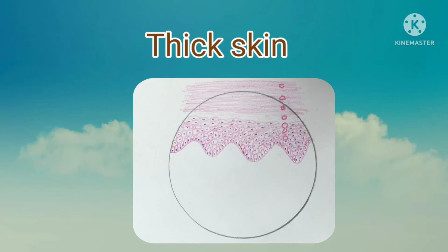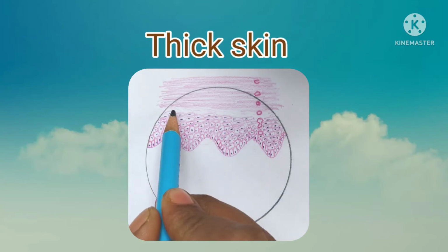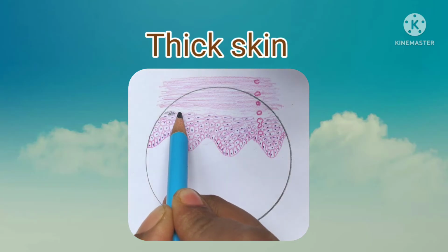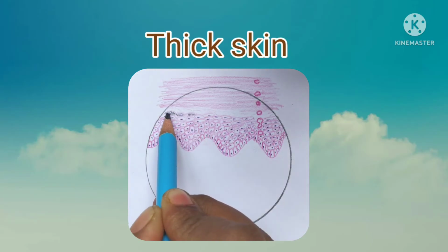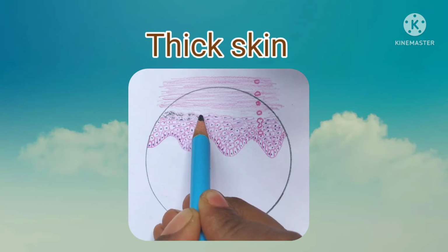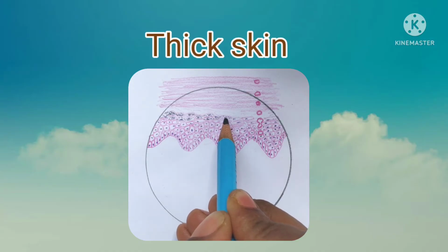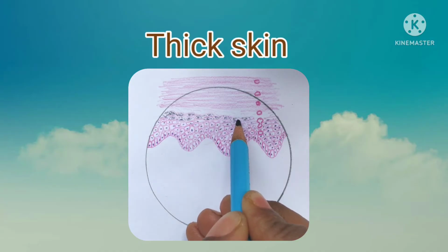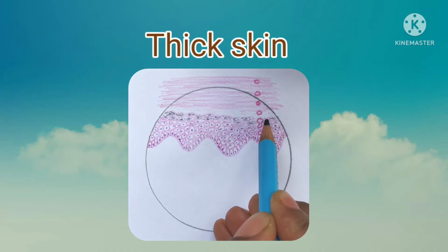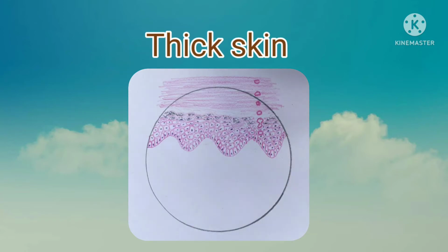We also have to show some granules, keratohyalin granules. Either you can do it with hematoxylin, the dark blue color granules, or with lead pencils. You can nicely see in the slides the dark granular layers, only for the granulosum layer cells. This is the epidermis. You have to show all the 5 layers in the thick skin.